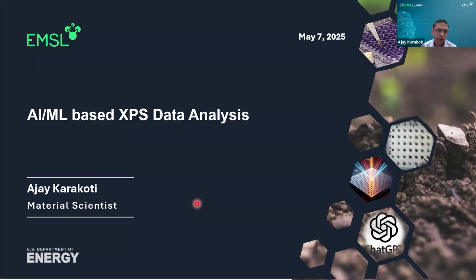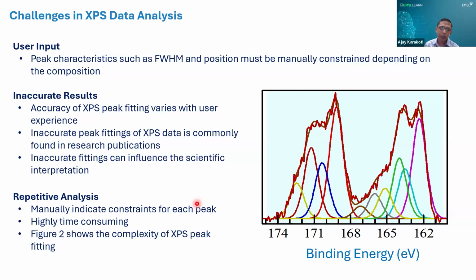Before I begin, let me put a disclaimer that I'm not a data analyst. I'm a material scientist and a very heavy user of XPS. So this has spurred from our need for correct interpretation of XPS data. We are collaborating with multiple scientists here at PNNL who are experts in AI and ML to help us with the XPS data analysis. Okay, so as you have seen, Shuttha has shown you multiple things that XPS can do.